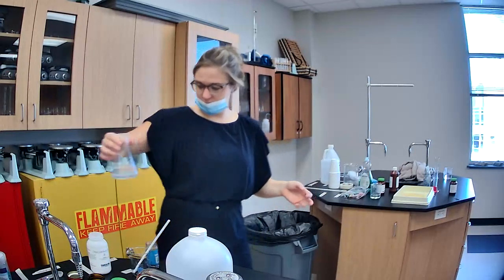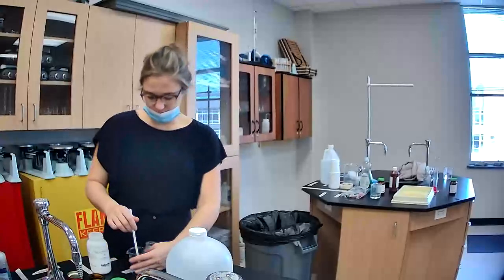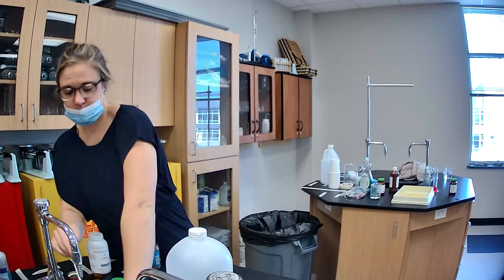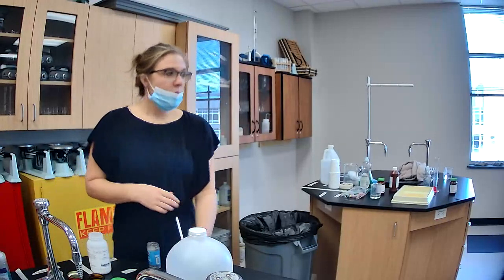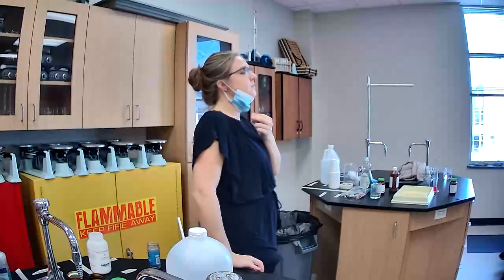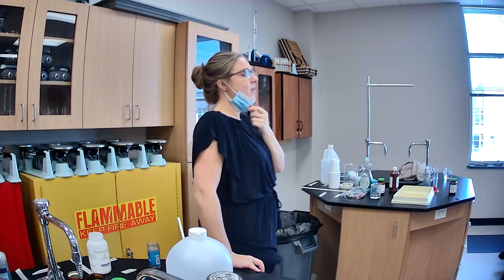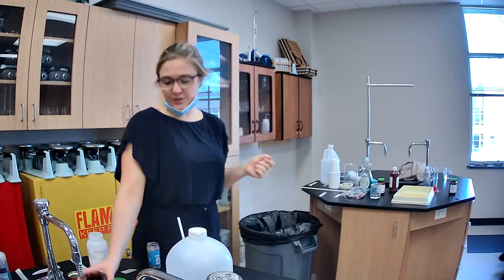Next, the yeast experiment. We talked about before, yeast is in what kingdom? Brian? Fungi. Okay, it is a fungus. It's unicellular.